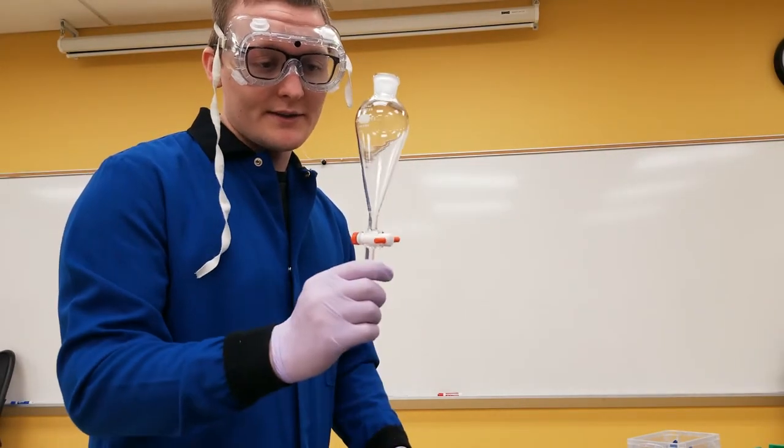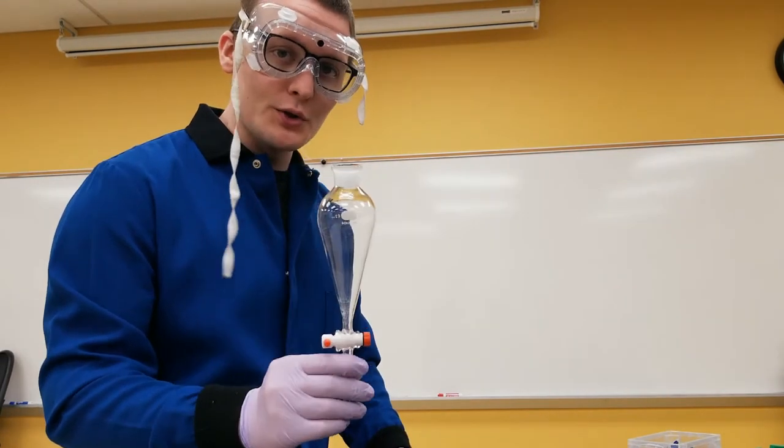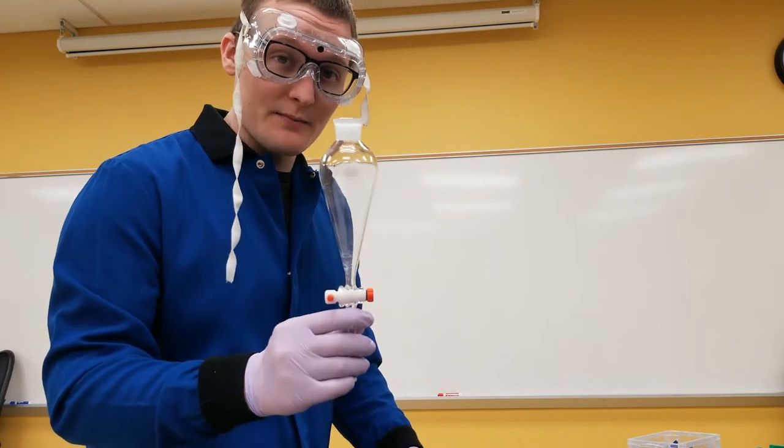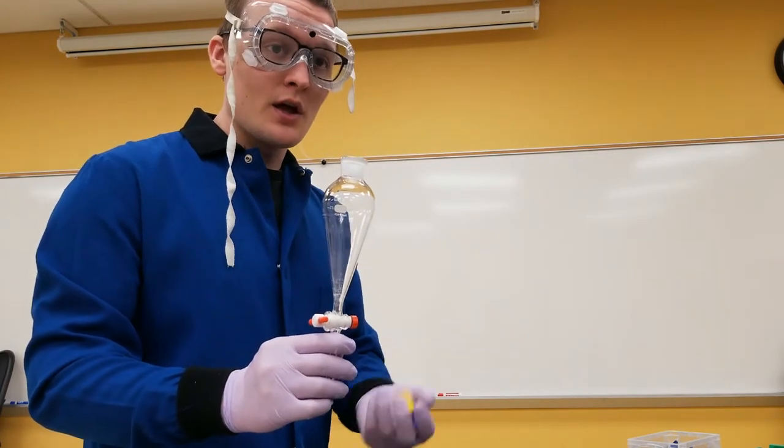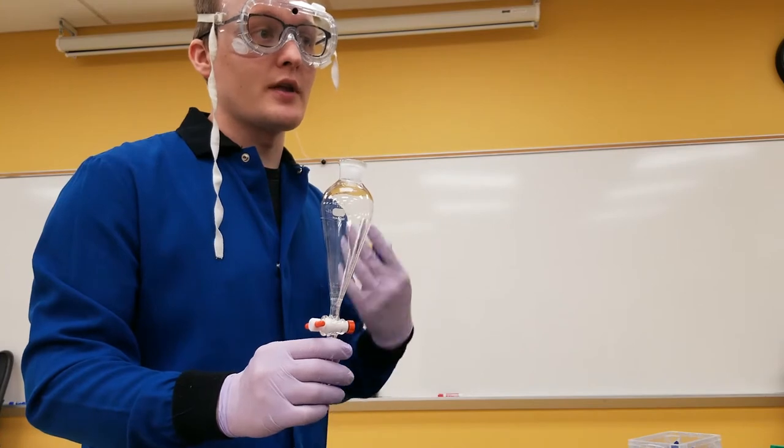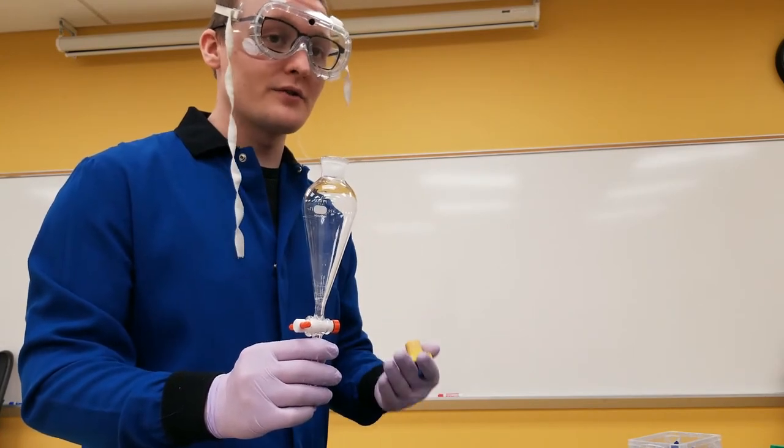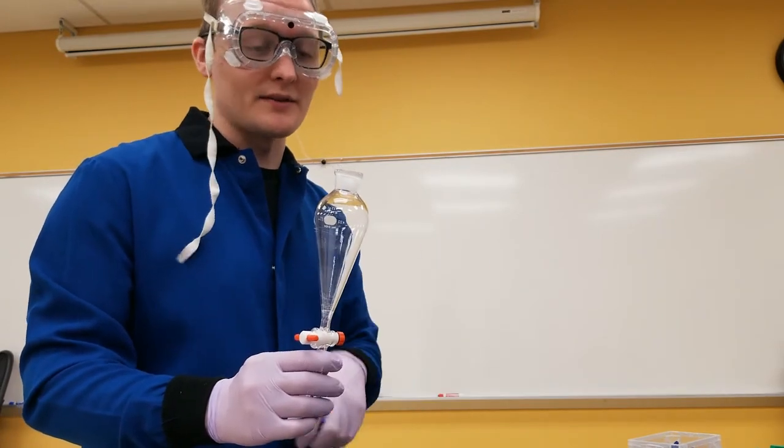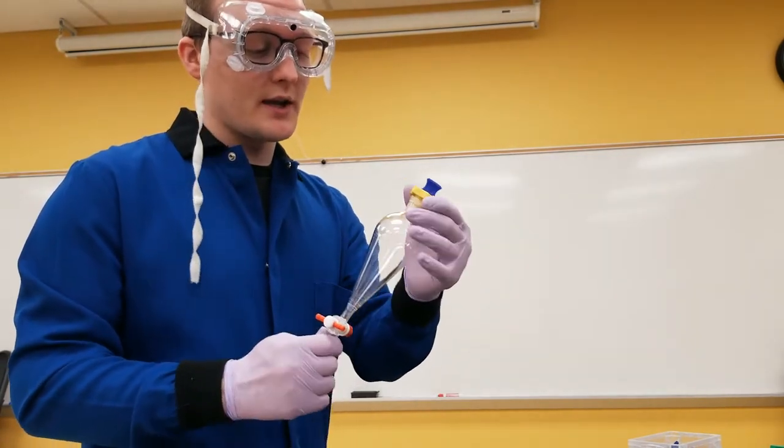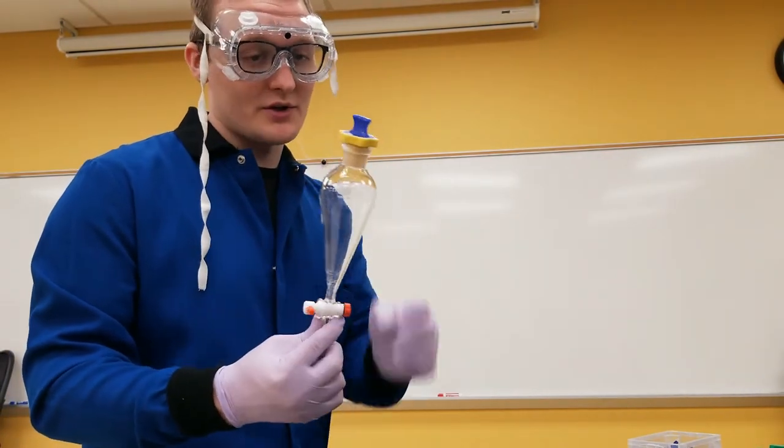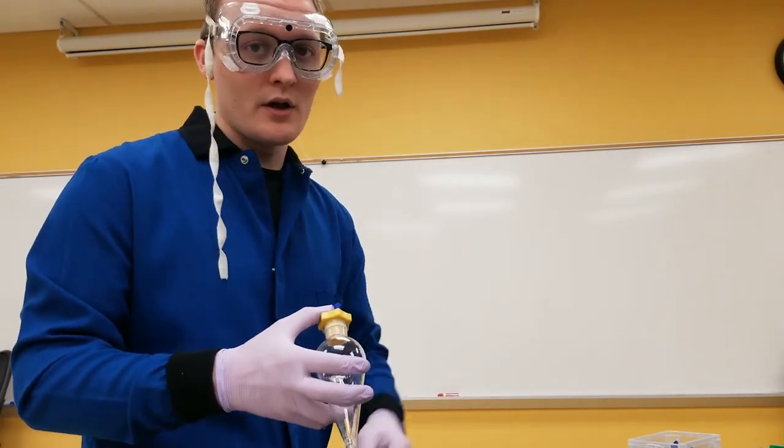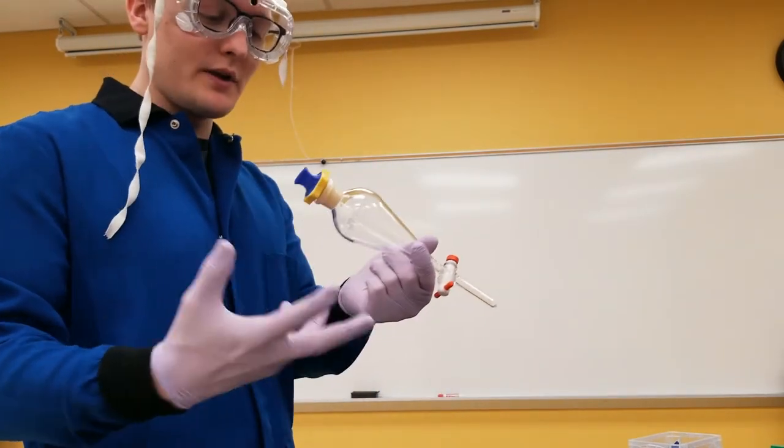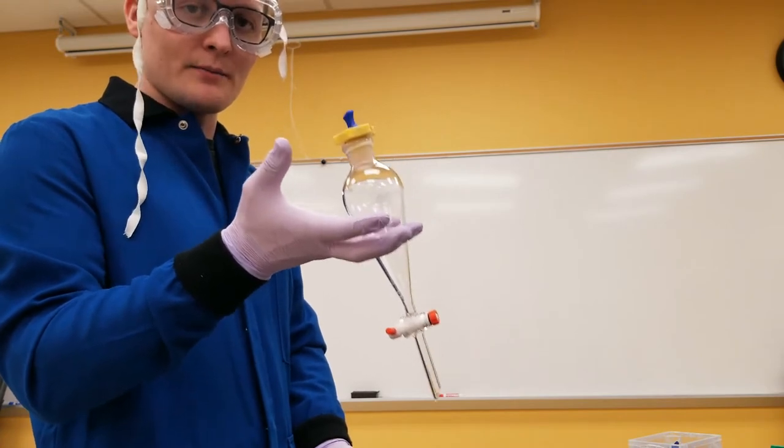So I have two layers of organic and aqueous solvents in my sep funnel, and I will be shaking them to make sure that all of the organic molecules can be dissolved in the organic layer and all the aqueous can be in the aqueous layer. While I'm shaking, I'm going to put on the cap, which I refer to as the shaking cap because it only needs to be on while you're shaking. And I'm going to do kind of a sweet wine glass holding motion here.